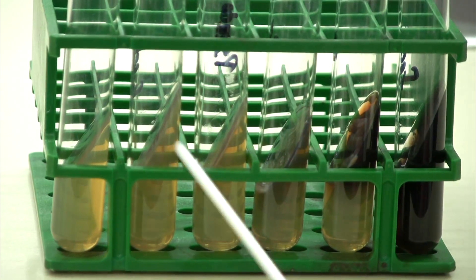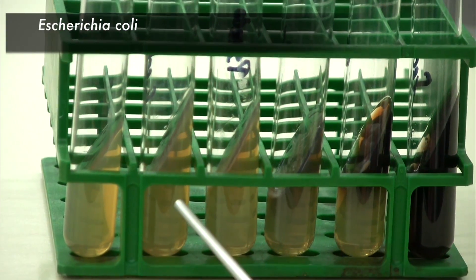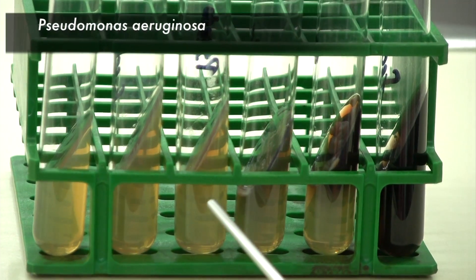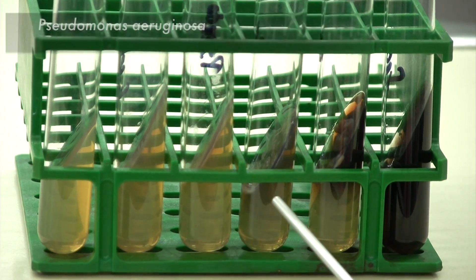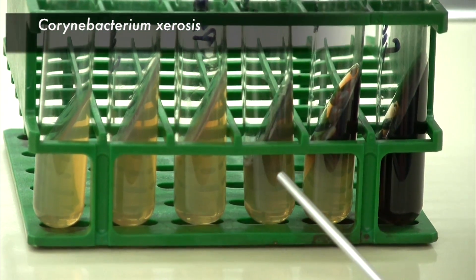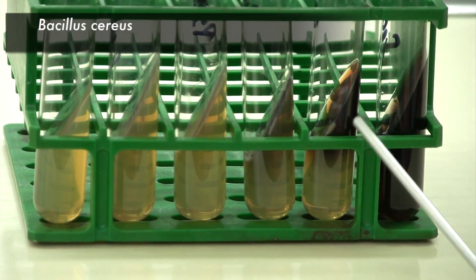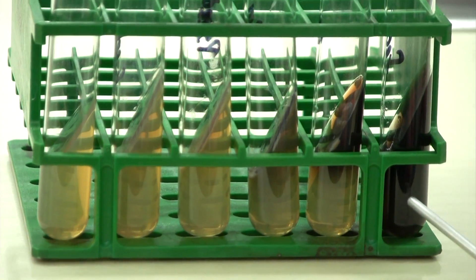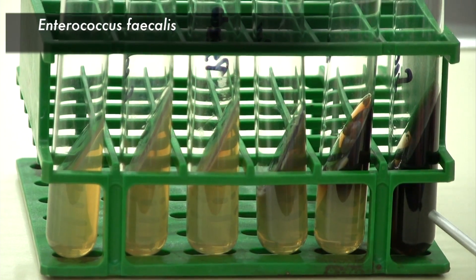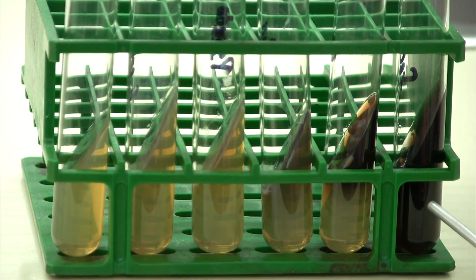Okay, the organism in this tube is E. coli, and in this tube it is Pseudomonas, and in this tube it is Corynebacterium, and in this one it is Bacillus cereus, and this one is Enterococcus faecalis, which is a true enteric organism.